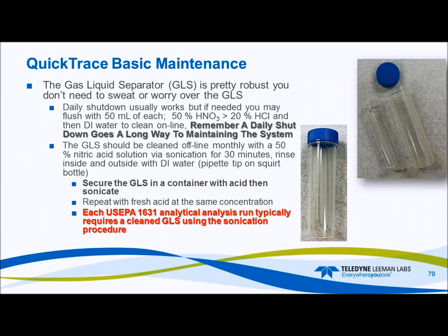And I have to reiterate keeping serialized numbers of your pipettes and different apparatus that you're using during this process. Keep everything in control. Basically, play the 2-year-old and say, mine. So it's mine. Nobody else can use it.